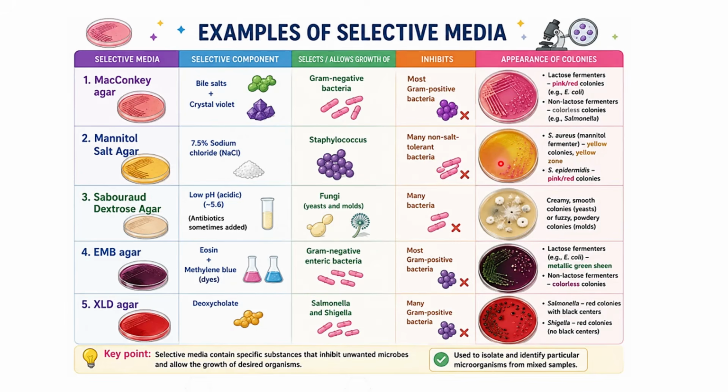The Mannitol Salt Agar medium is also used to differentiate these salt-tolerant bacteria that are allowed to grow on it into mannitol fermenters and non-mannitol fermenters.